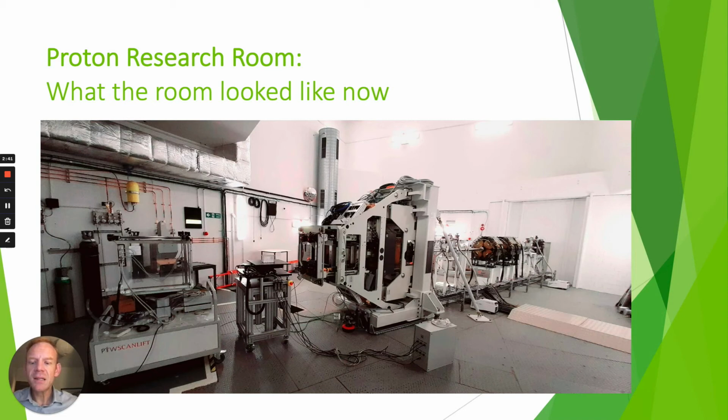And really this design came about because Evan and his team were able to ask us a lot of very detailed questions about what would the robot do, how hot would it get, you know, how big was it, what do the cell dishes look like. The questions were endless, and this was part of a three-party design process that my colleague John is going to describe some of the challenges of.